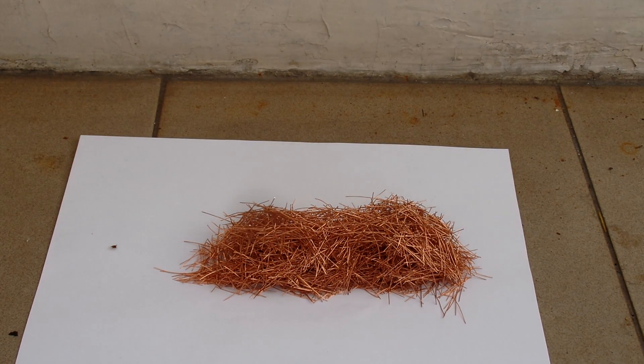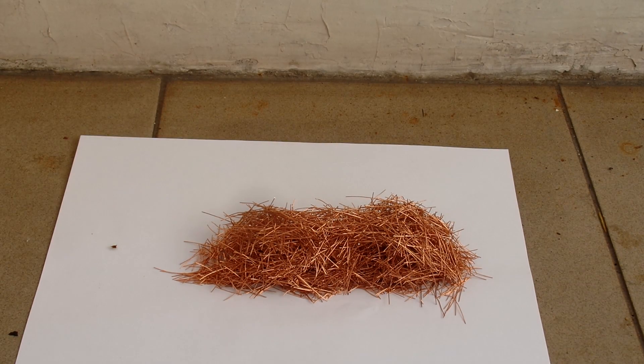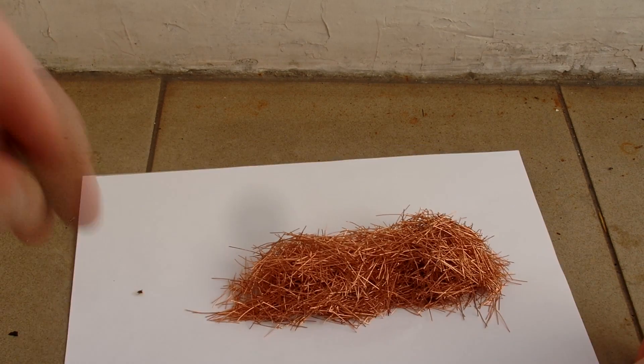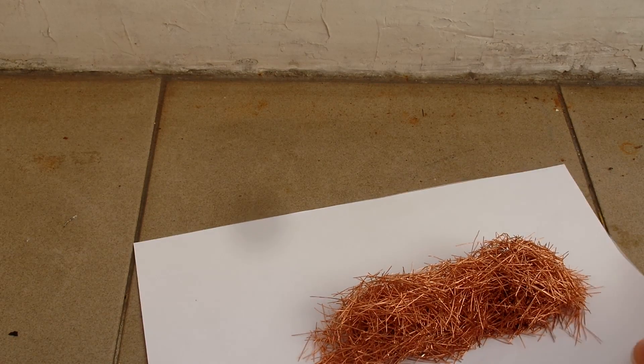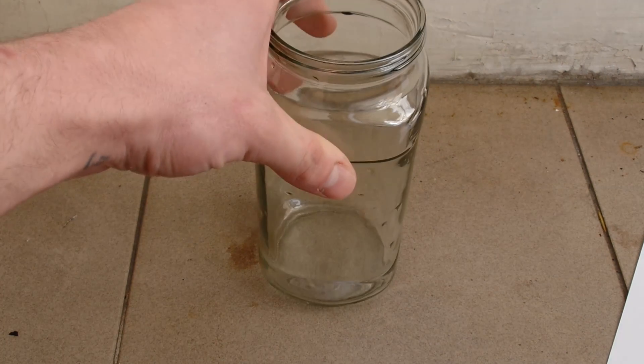First you will need some copper. I have more than 100 grams here. These are tiny bits taken from a wire.